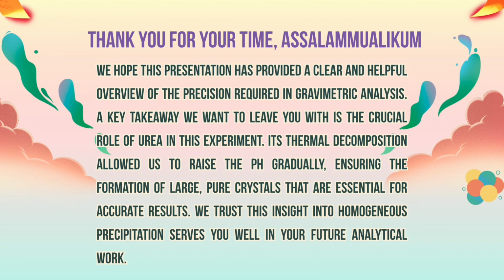That's all from us. We hope this presentation has provided a clear and helpful overview of the precision required in gravimetric analysis. A key takeaway we want to leave you with is the crucial role of urea in this experiment. Its thermal decomposition allowed us to raise the pH gradually, ensuring the formation of large, pure crystals that are essential for accurate results.